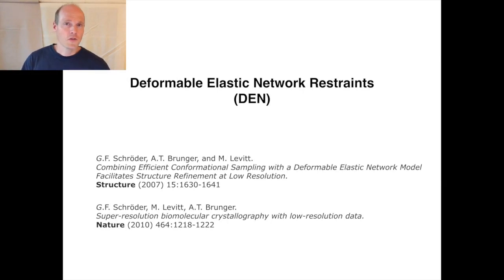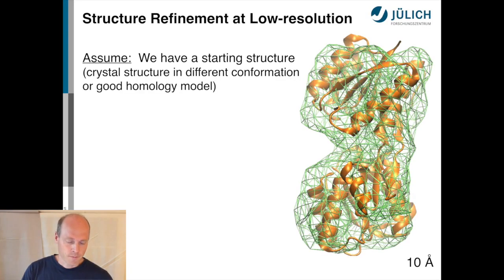Okay, so here I want to describe the concept of the deformable elastic network restraints, DEN restraints, which are explained in much more detail in these two papers here. The motivation for this came from the problem of refining protein structures at very low resolution.